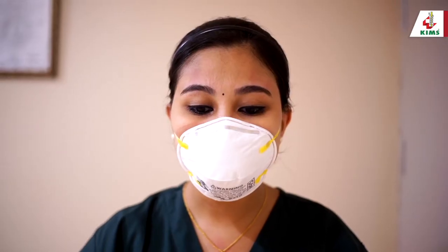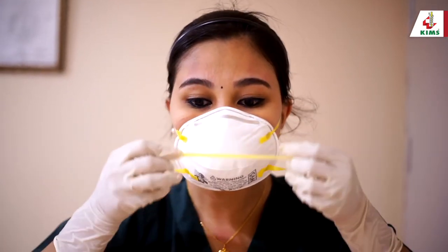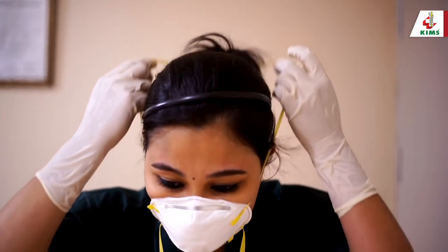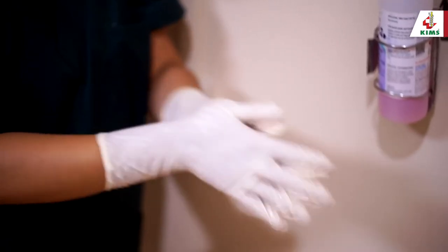Last, remove the N95 mask by stooping forward and pulling the lower strap first, bringing it forward, then the upper strap. Discard the mask holding the straps only. Do not touch the front of the mask. Now perform hand hygiene.